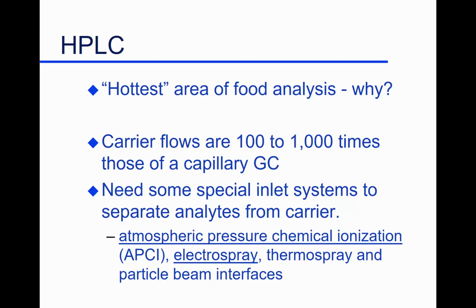LC, I have to concede, yes, is the hottest area. That's a concession to your instructor, who loves liquid chromatography. And it's coming into its own. It's really well established in the food industry. There have been so many advances in liquid chromatography too, that it truly is moving more and more into the labs everywhere. Cost has come down, so cost is reasonable, and capabilities have been improved. And now, again, putting liquid chromatography together with mass spectrometry gives it a great deal more power.